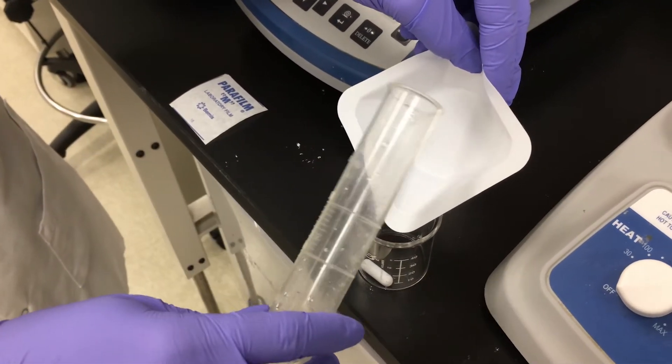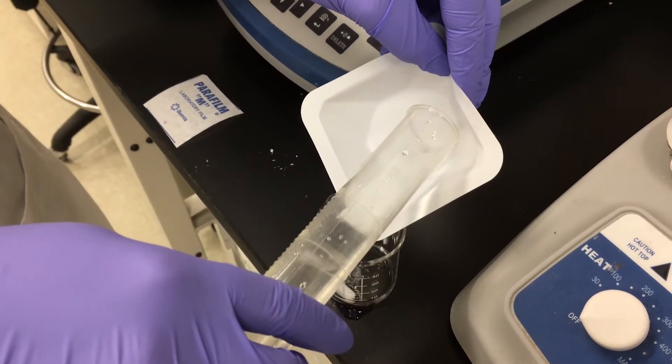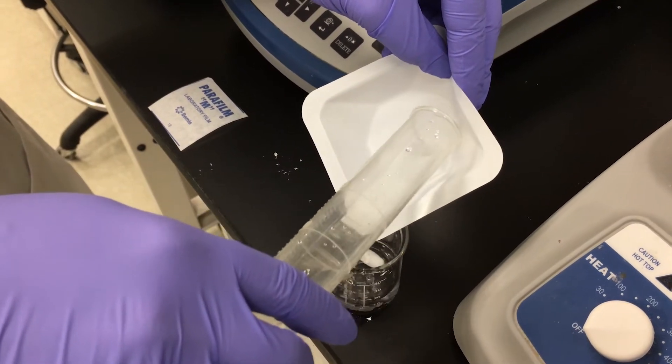Carefully add the measured sodium borohydride to a beaker with a magnetic stirrer, using cold water to rinse it fully into the beaker.